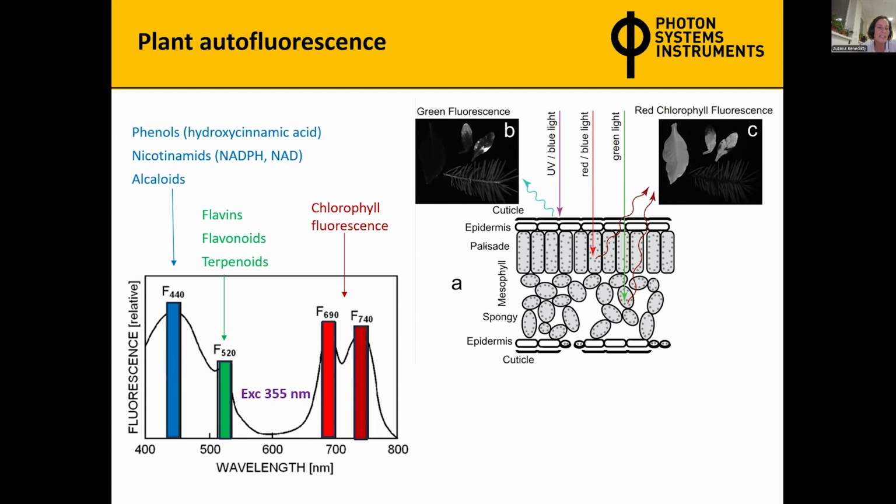The blue-green fluorescence and chlorophyll fluorescence and the ratios depend also on the status of the plants and the health status of the plants. The spectrum can also change if you measure fluorescence, for example, from up or down. It very much depends on how the light penetrates inside the tissue. Some leaves are very thick, some leaves are less thick.